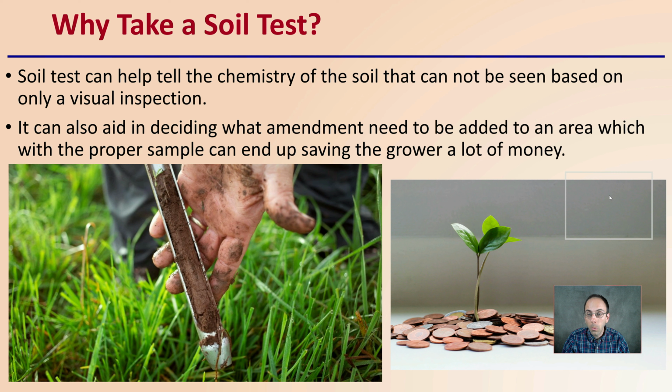Here on this DeBacco University video, I'm going to go over how to properly take a soil sample, because it's very important that you follow the right protocols so that you're sending a quality sample to the lab that you'll be basing your results from.